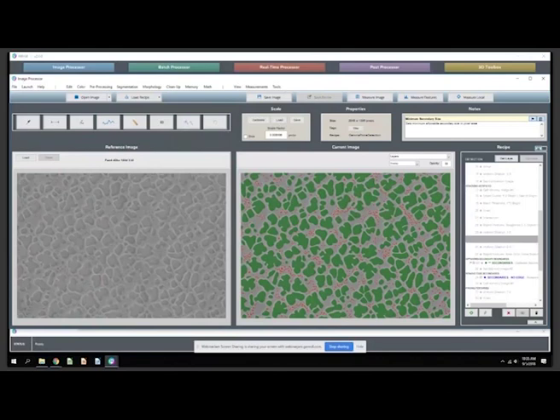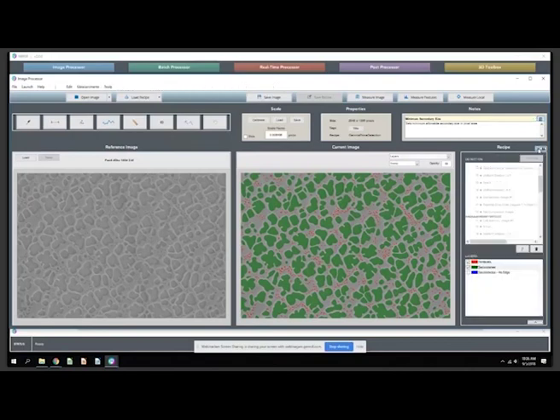Looks like they also have a question on cumulative size distribution for the nickel particles. That is, I may not be completely understanding the question.